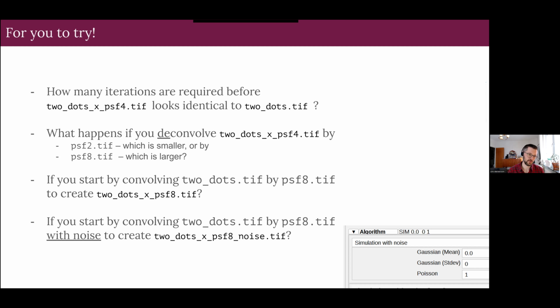So if you pick one of these, I will show you what you would expect to get for all cases a little later. So pick whatever you think is interesting, and we will hold here for a few minutes while you do it. And any question, just feel free to talk.